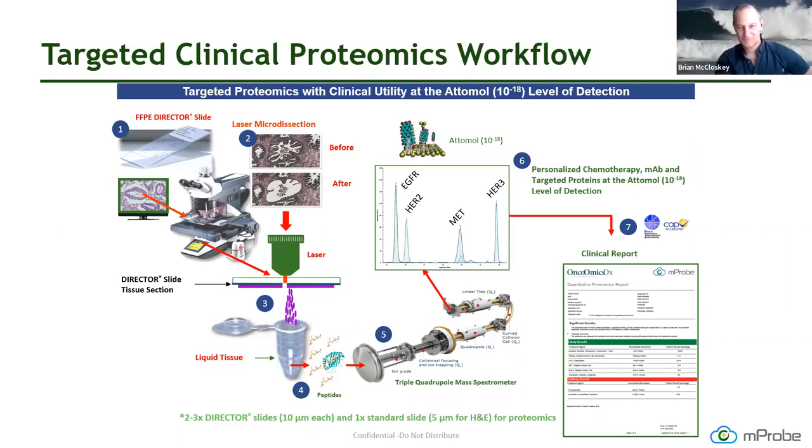So this is the process from start to finish. This is what happens behind the scenes. A lot of our time is honestly spent wrangling the tissue out from the pathology labs, and that's not a pretty process. But once it is in-house, 5 days later, there's a clinical report that goes to the oncologist, and then we end up connecting with the oncologist and saying, hey, this is what we saw, so that they can get more depth of what came in our clinical report.